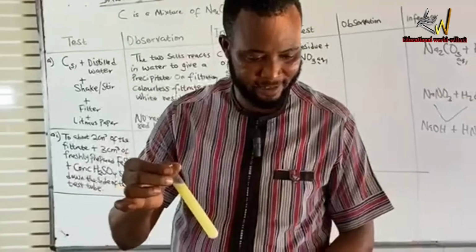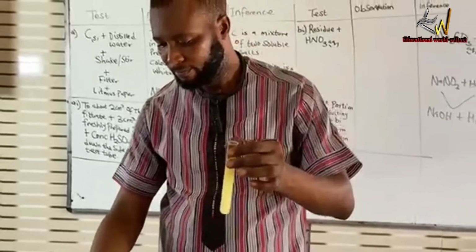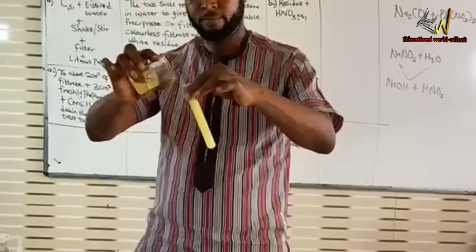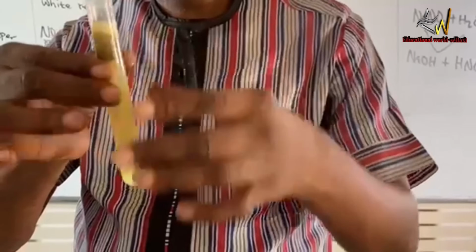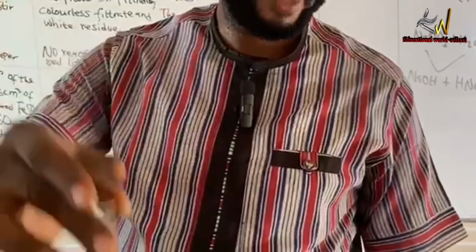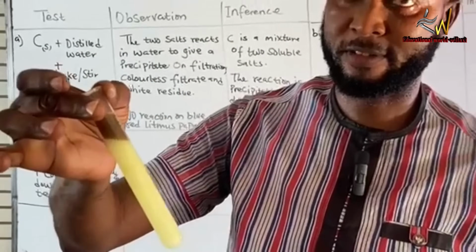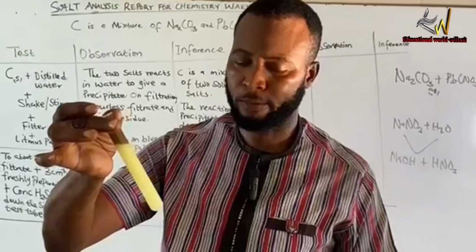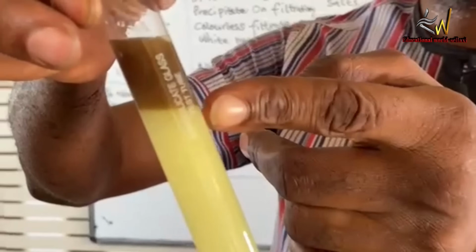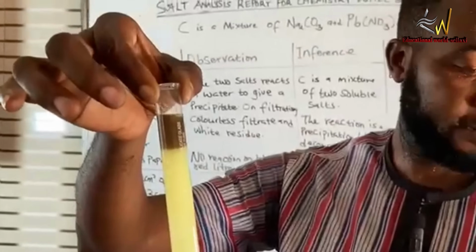The acid is very hot. There's an exothermic reaction. I think I'm getting a brown ring. You can see it, the brown ring at the junction of the two layers. So this is the brown ring. The solution was down here, and here, the acid. That's the brown ring.